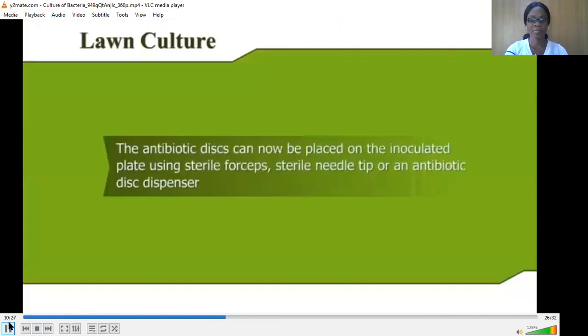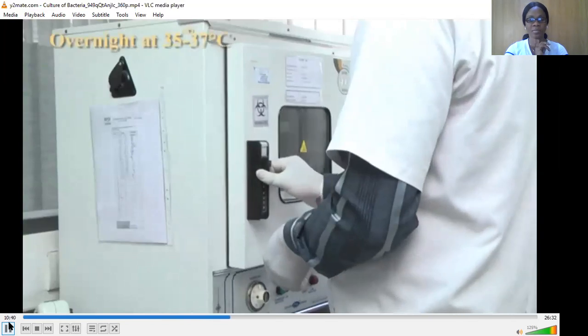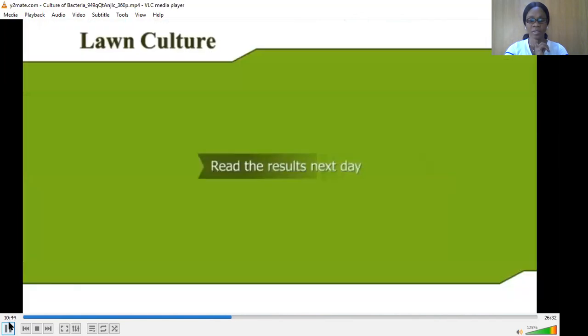The antibiotic discs can now be placed on the inoculated plate using sterile forceps, a sterile needle tip, or an antibiotic disc dispenser. Incubate the plate overnight at 35 to 37 degrees centigrade and read the results next day.